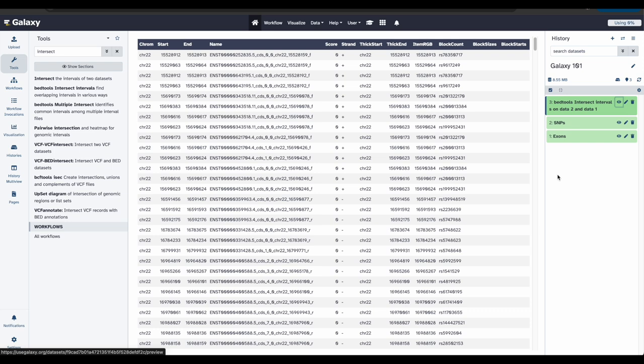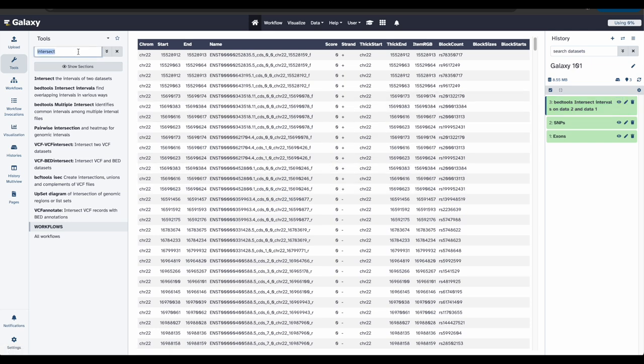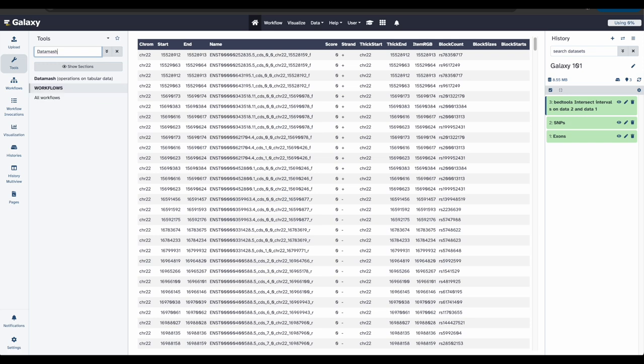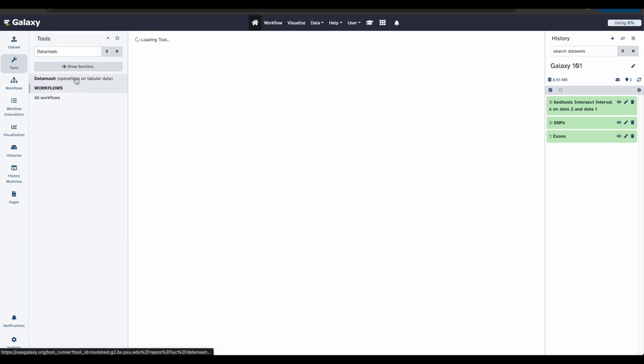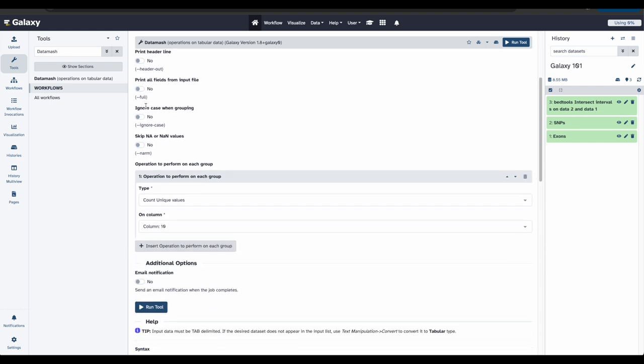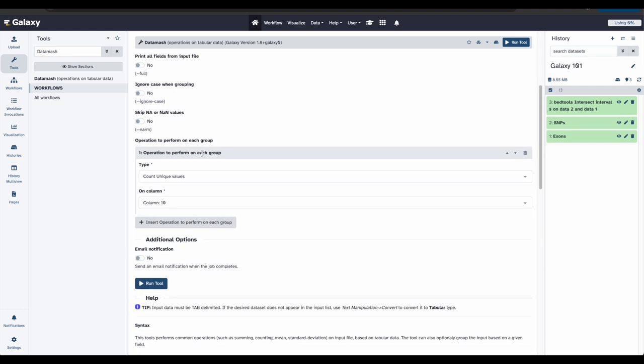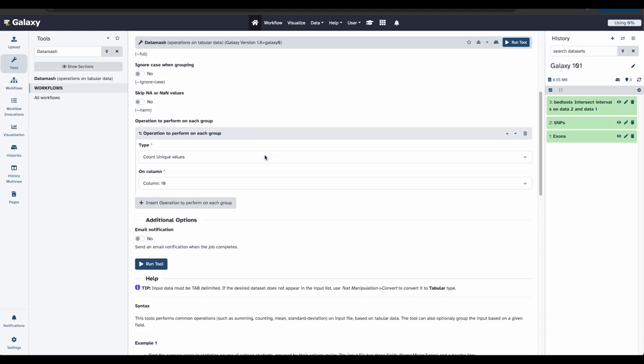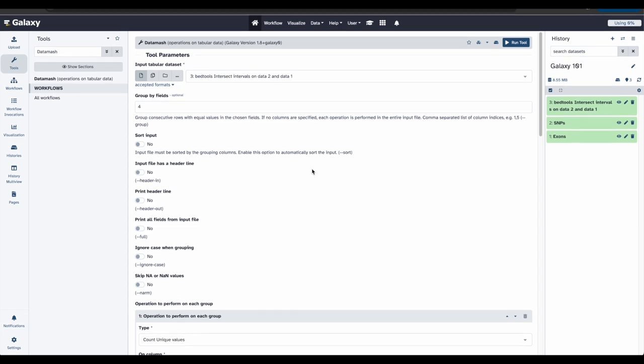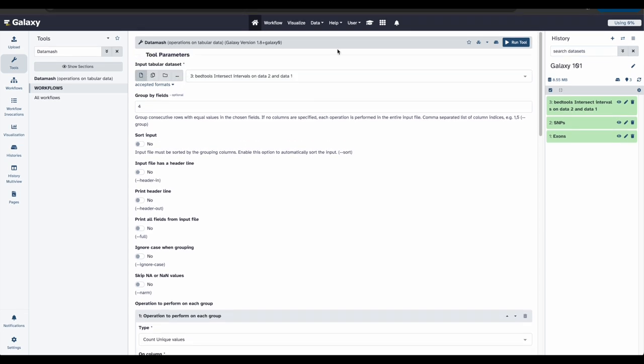So, let's do this for all the exons in our file. Going back to the search bar in the tool section, let's now search data mash. And we will select data mash operations on tabular data. Now, we can update the tool parameters. We want the data file that was just produced to be our input tabular data set. And we want to group the fields by four, which is column four. Scrolling down to operation to perform on each group, we want to count unique values on column 10. Once the tool parameters look like this, you can click run tool.